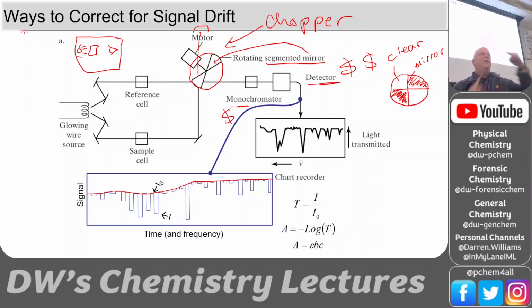So when it's clear, they cross, and when it's mirrored, the reference gets blocked by the mirror and the sample gets reflected. So it's basically really quickly chopping the signal into reference, sample. So if you had a Spec 20 and you were trying to do this, you would do this 1,000 times a second, 1,000 hertz. Blank, reference, blank, reference, blank, reference. So that's what it's doing for you at really fast speeds.